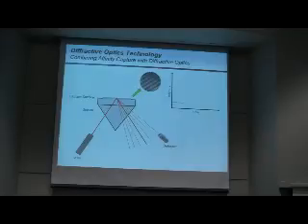So you make the lines of an antibody, and an antigen binds that you're trying to measure specifically, the spot will get brighter. And the purpose of this prism here is we can actually monitor this in real time. So we make the lines out of avidin and biotinylated antibody binds. We can follow that binding and characterize it, or use this delta to understand how much was there.